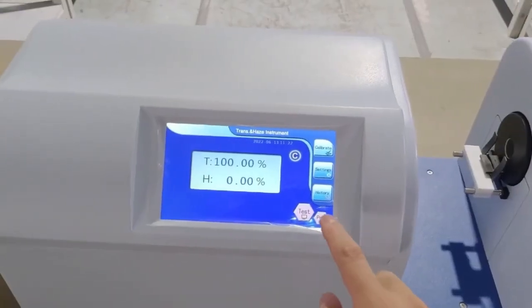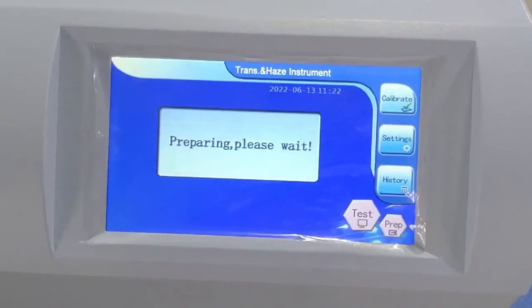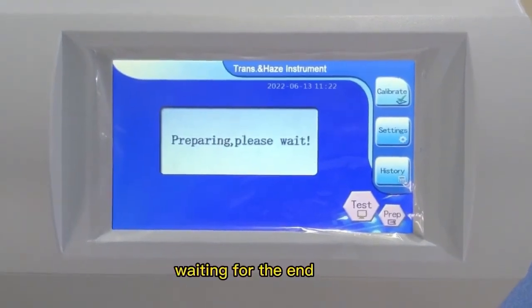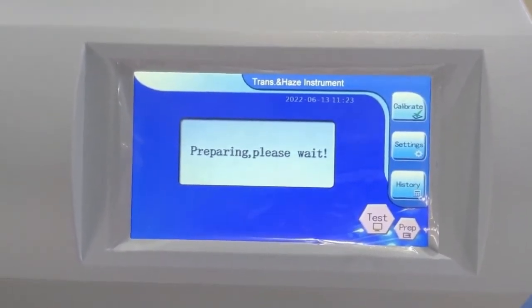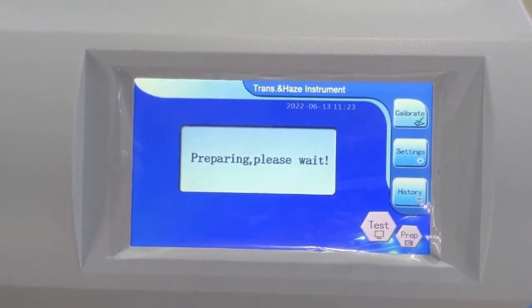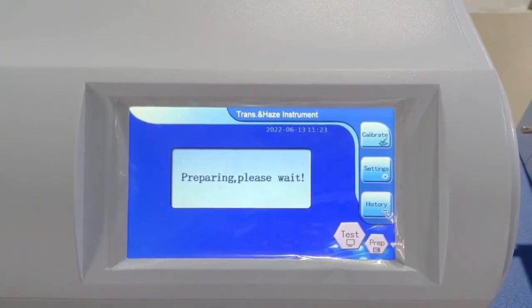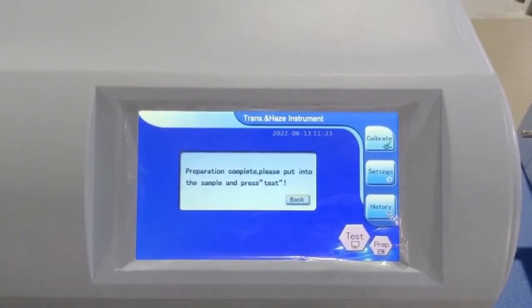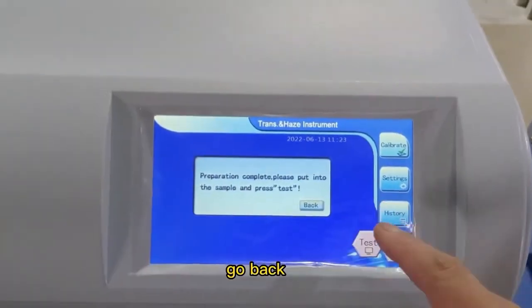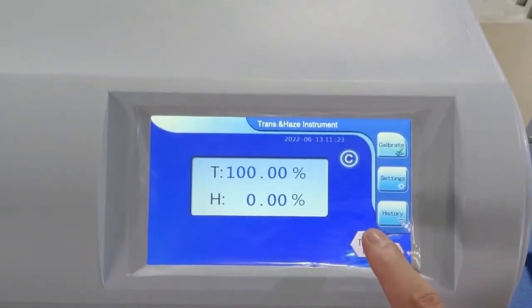Click the Prepare key and wait for it to finish. Go back, then click the Test key to make an empty test.